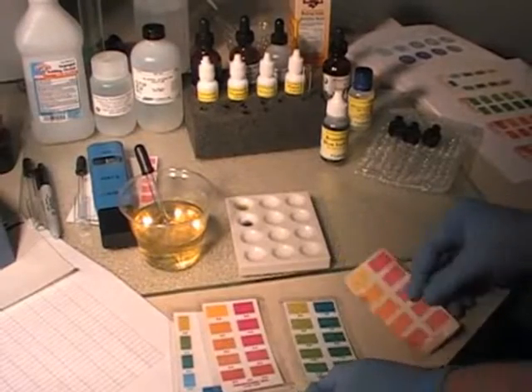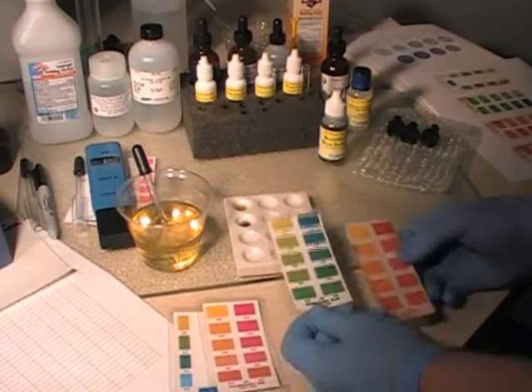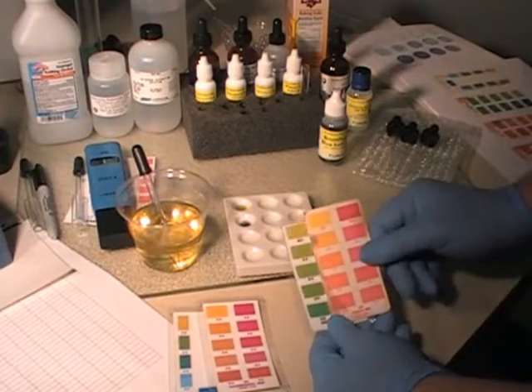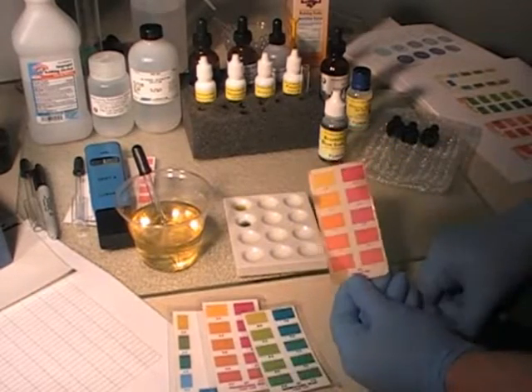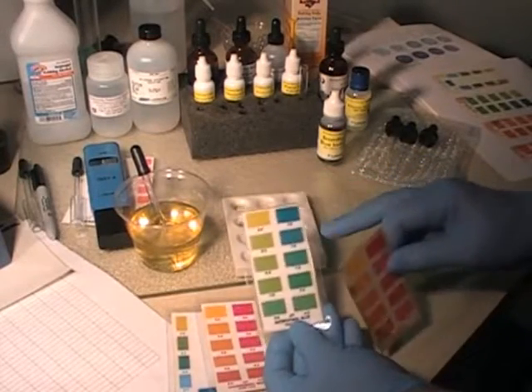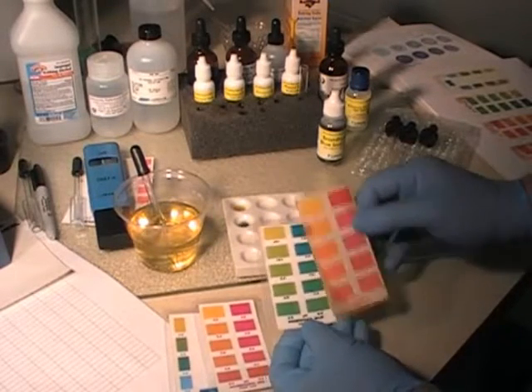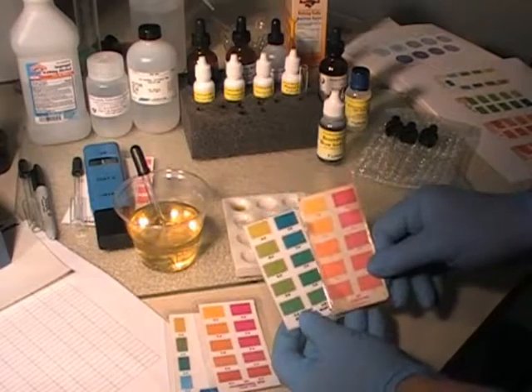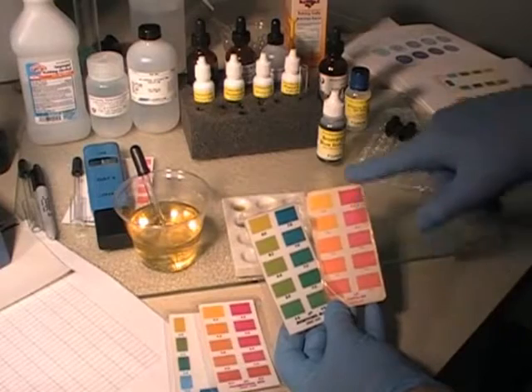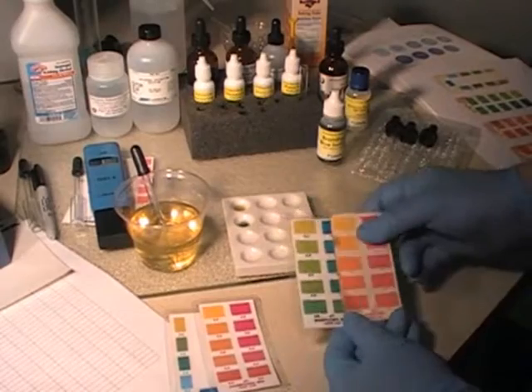In this case, again, since we know for sure what the color is from the bromthymol card, we don't have to go to the next card up, which is the phenol red. And pardon me, but this is my original phenol red card. It's all beaten up. But if, for example, we had a very dark blue there, at that point we probably wouldn't be sure, and so we would then take a drop of phenol red, and we would get colors probably from this range right on up to 8.4, which is as high as you can go on the pH for a human. And so those are your cross checks.